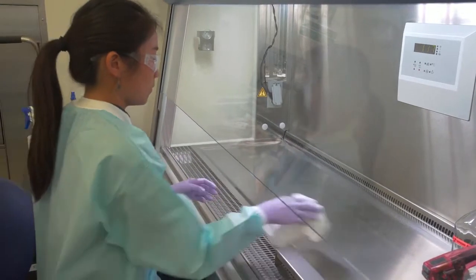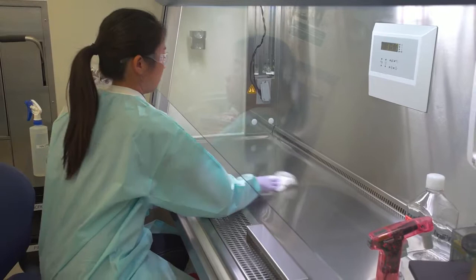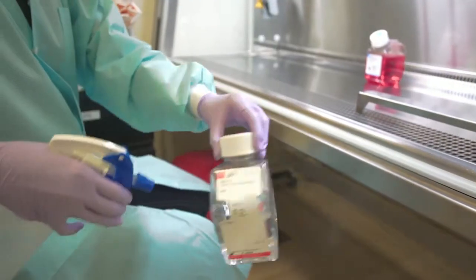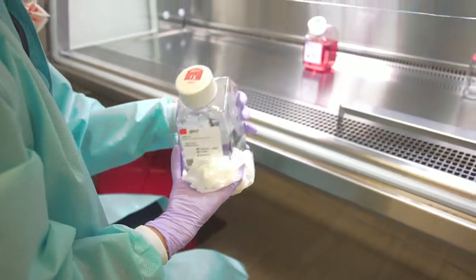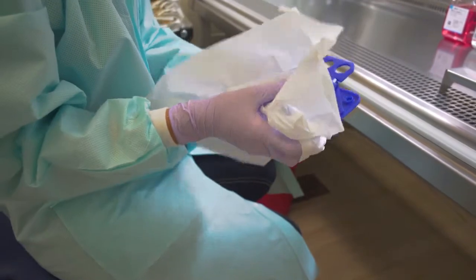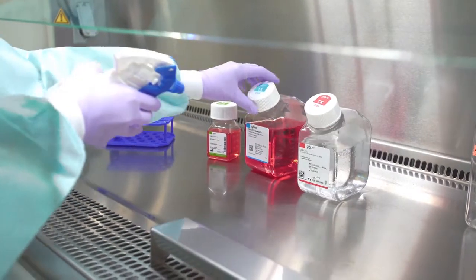Always clean the hood before and after use. Spray alcohol should not be used in any area where a flame is being used due to the fire hazard. The outside of containers carry dust and contaminants, so remember to clean each item placed in the hood with ethanol. You may choose to spray the item before placing it in the hood or immediately after, as demonstrated.